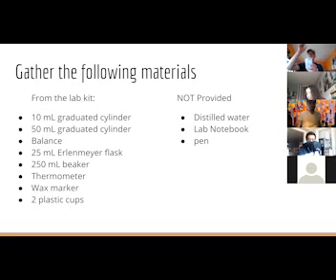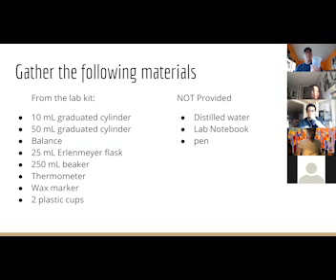It's not going to be throwing off fumes or splashing out of it. Whereas a flask is designed basically to keep stuff from splashing out of the top. So the top is much narrower than the bottom. A beaker is the same on the top and the bottom. The shape is the same.